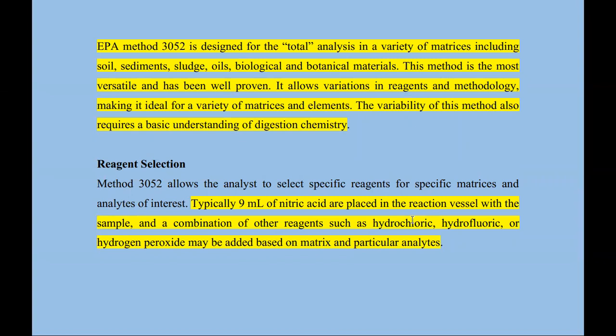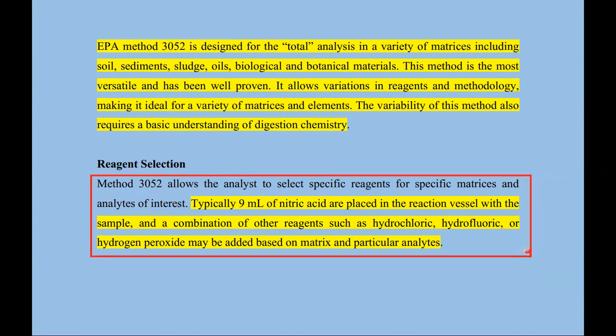So you find that metals that form complexes are vulnerable to acids that are able to contribute ligands. When you're choosing the reagent for metals that are likely to form complexes, it is important that you avoid acids that are able to contribute ligands.